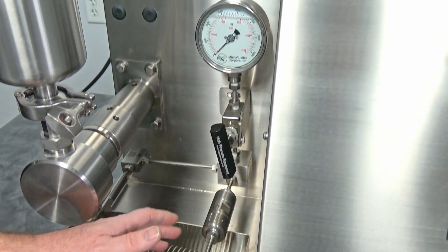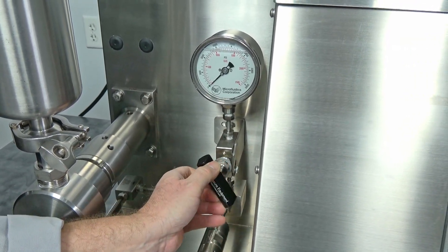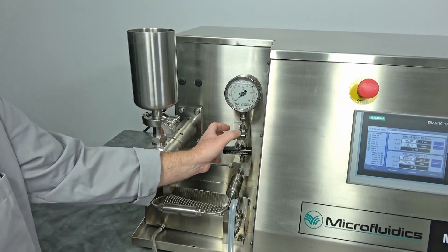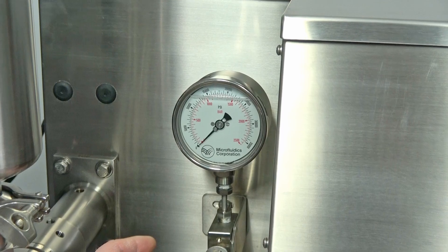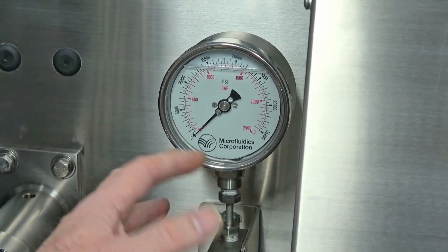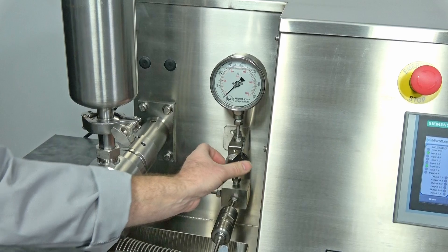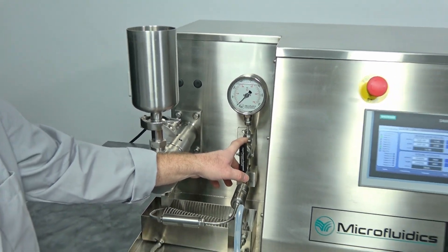It does have a diamond mixing chamber with, I think, a 100-micron interaction chamber. It also has the pressure gauge, and one nice feature is that the pressure gauge has a shutoff valve. Pressure gauges aren't meant to handle constant hammering — this machine hammers: it shoots the gauge up to 30,000 PSI, drops off, shoots it up, drops off. That's really hard on gauges. Once you've established your set pressure, you just shut the valve off, which conserves the gauge and prevents damage. I've seen many cases where pressure gauges start leaking from that hammering effect.